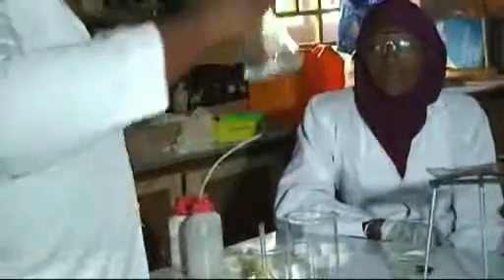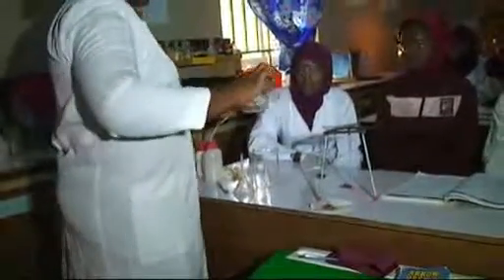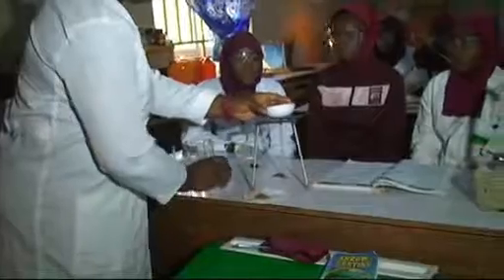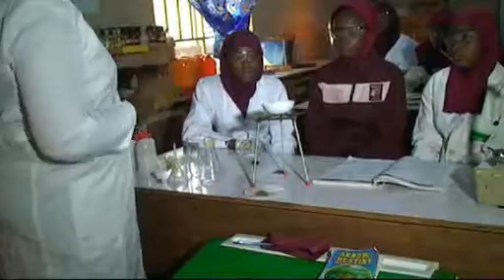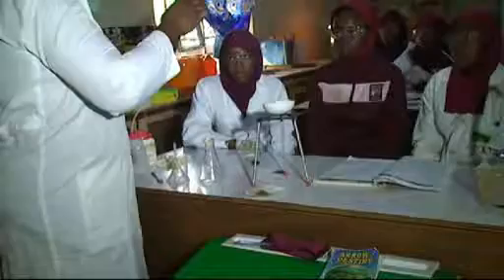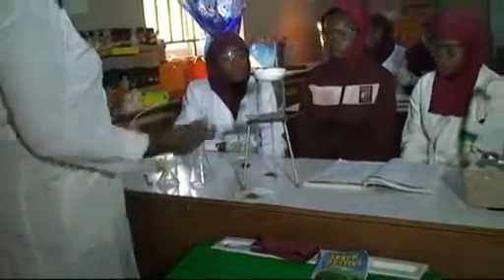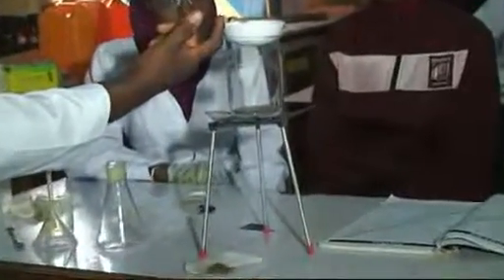We have two methods of evaporation. There is the one we call direct evaporation. In that way, you pour in your salt water into the evaporating dish, place it directly on the Bunsen burner and allow it to dry. Or alternatively, you can put in enough water in a beaker and then use steaming method. We call it indirect evaporation. So that as this water here is boiling, it is also heating up this.